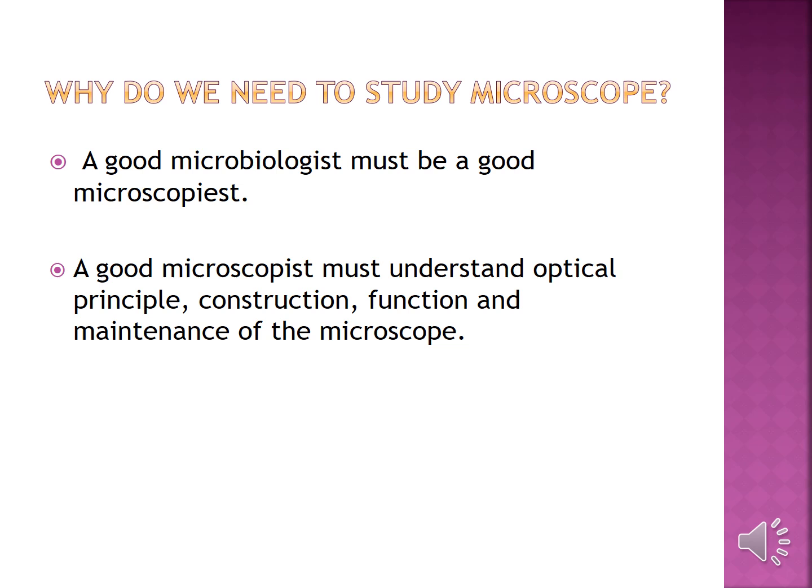So why do we need to study the microscope? A good microbiologist must be a good microscopist. I think this should be shown to my dearest madam. A good microscopist should understand the optical principles, the construction, function and maintenance of the microscope.